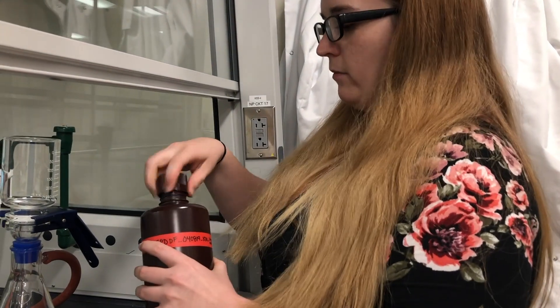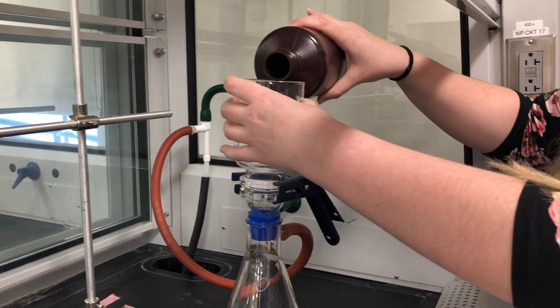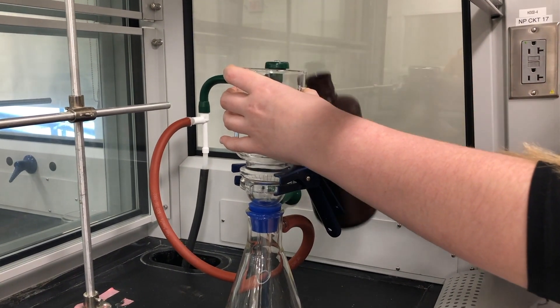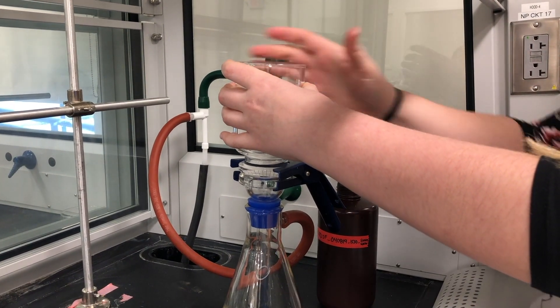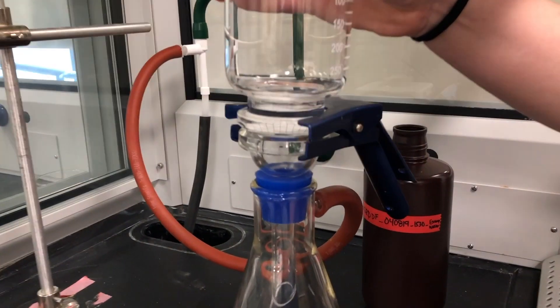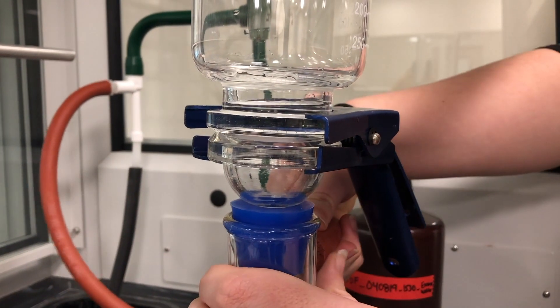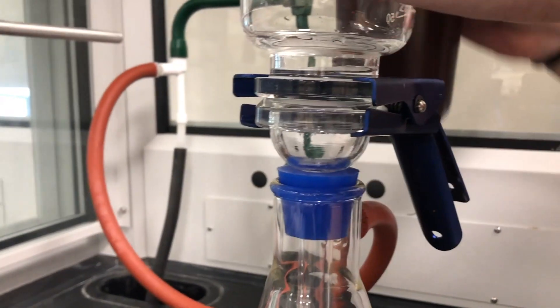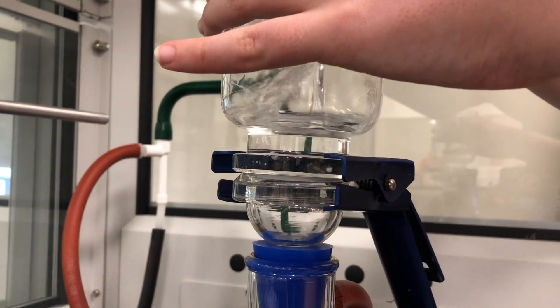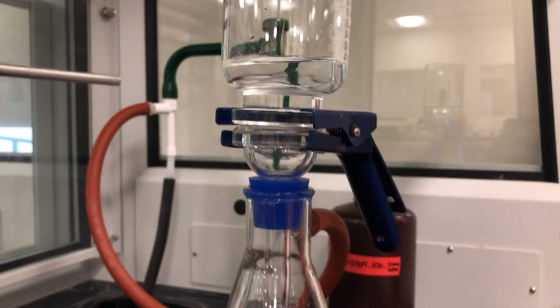Lastly, we're going to take our sample and our one liter bottles and just pour a little bit in, make sure it's not leaking or anything, and then we're okay to pour the rest in and allow that to filter all the way through.